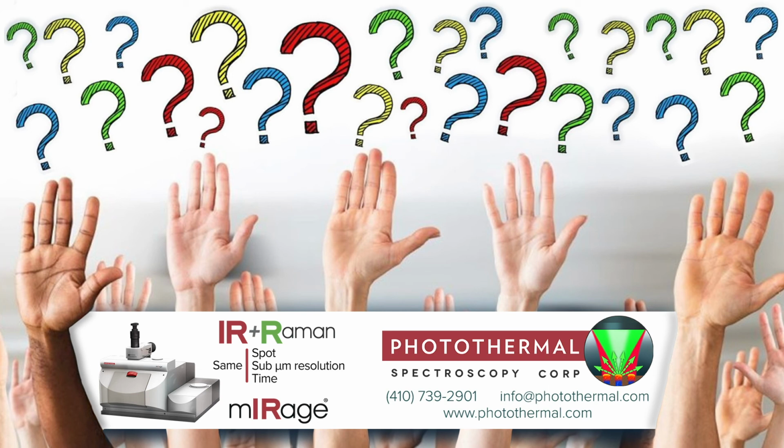The first question says, if O-PTIR uses a green laser for both Raman and O-PTIR detection, why does O-PTIR not have fluorescence when Raman still does? The key to that is the fact that the IR signal is modulated, it's pulsed. And so that means that the infrared photothermal signal is also pulsed and modulated. And that appears in the green reflected light or transmitted light signal as a slight modulation in the amount of visible light hitting the detector.